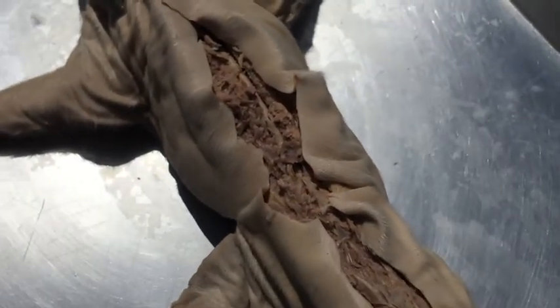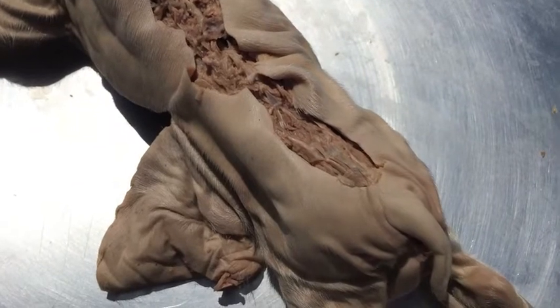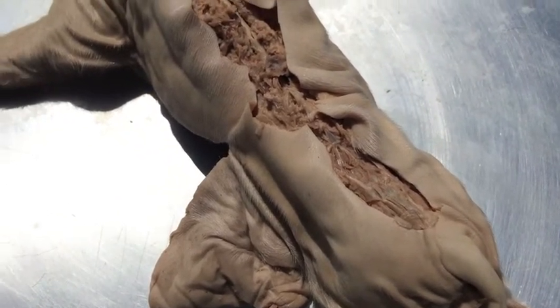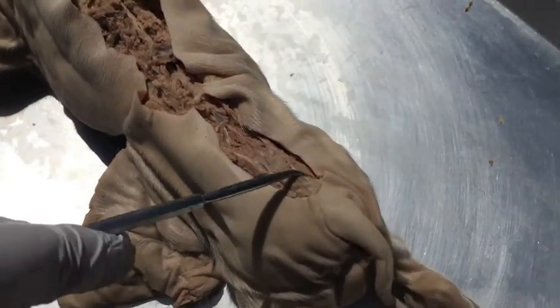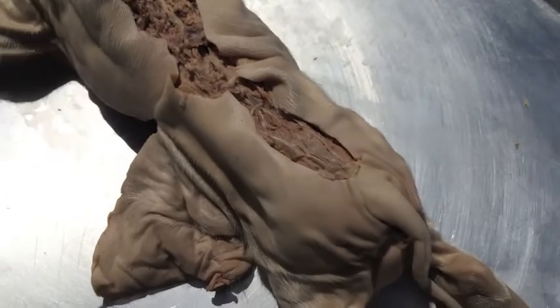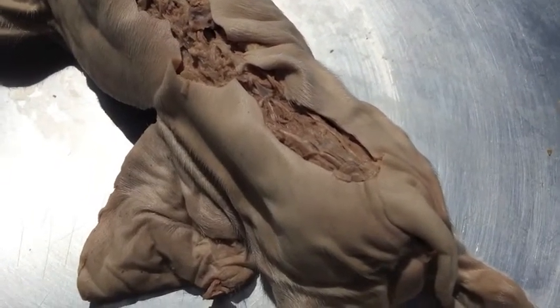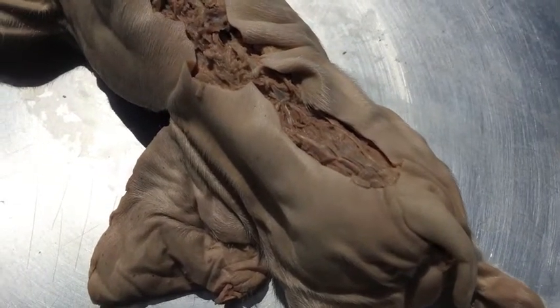Then next we have the sacral spinal nerves, which are going to be from here down, controlling the nerves in the spine and the hip area. And then next we have the cauda equina, which is going to be right underneath there in the pig, and that's the nerve that extends below the distal end of the spinal cord.